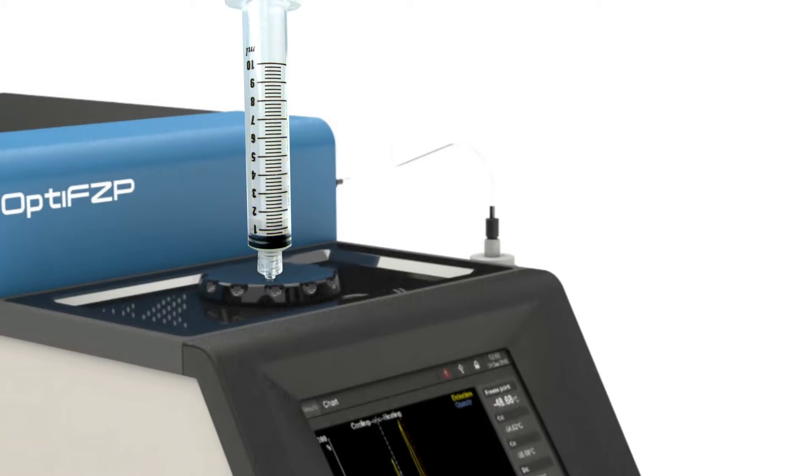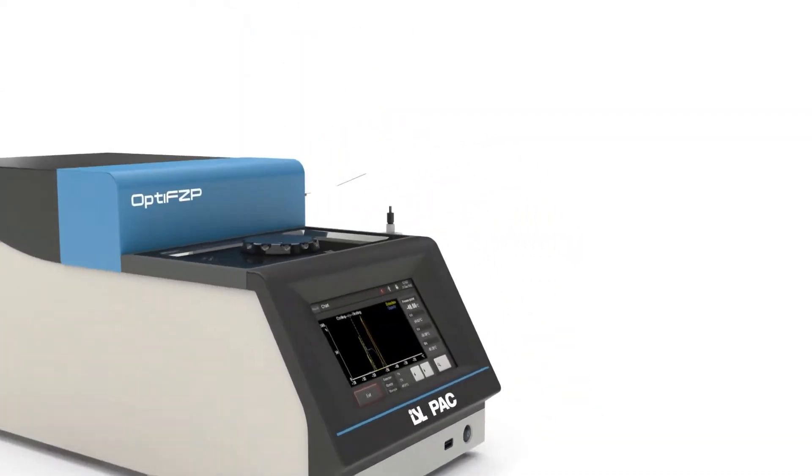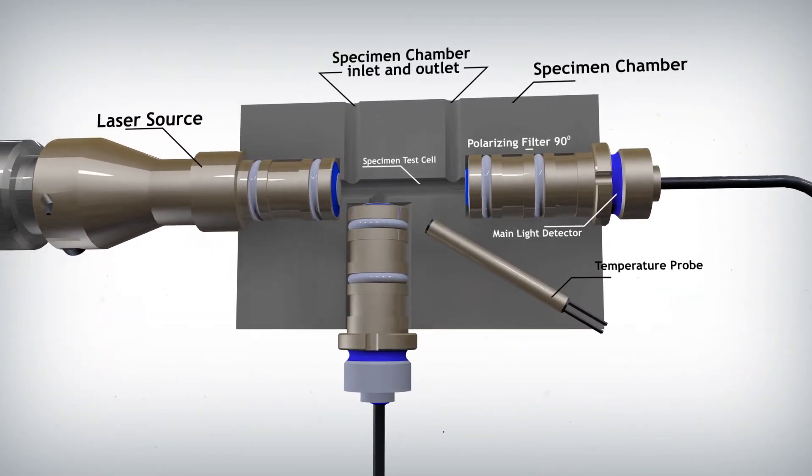The instrument takes care of the rest. OPTI-FZP is based on a unique and patented detection system using powerful optics technology. There are two optical sensors: the main detector and the opacity detector.